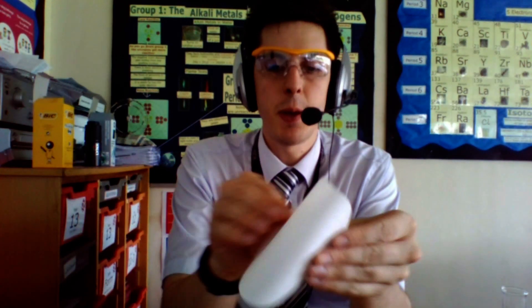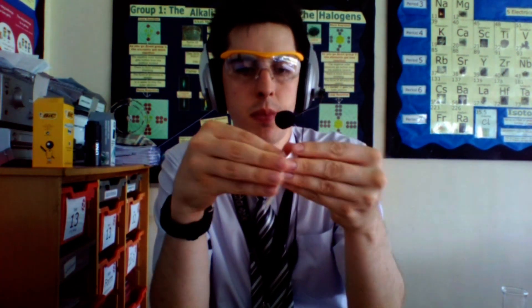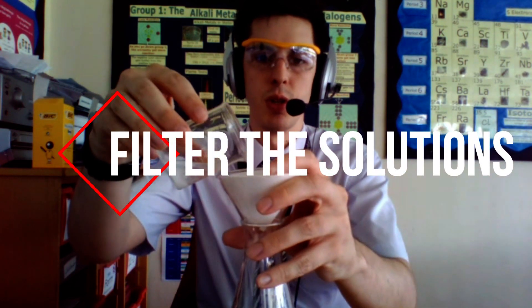The next step is to filter it through. Get your filter paper, fold it in half once and fold it in half again. Open it out and pop it into your filter funnel. That goes into your conical flask and then you tip your solution in.